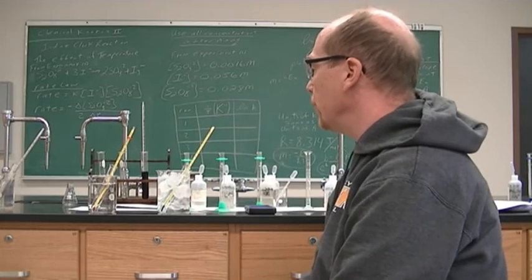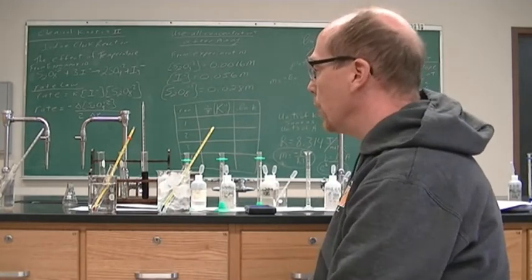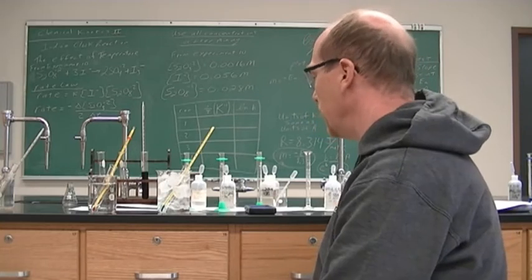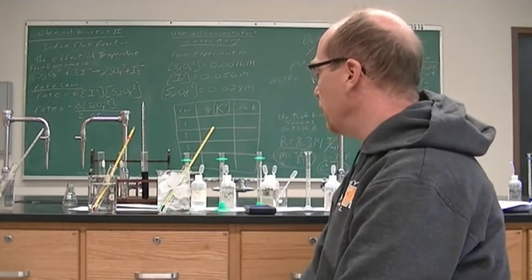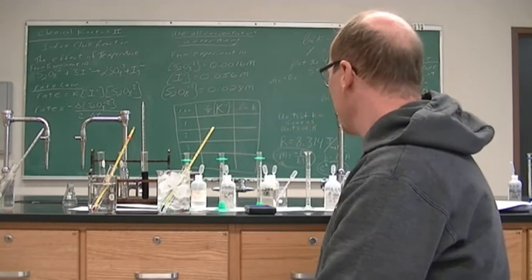We're going to write down the first number, and then we're going to wait and do our hot water last. It will be the fastest. So that one's not going to be near as long as the ice bath will be the longest, and then the cold water bath will be the second longest, and then the fastest is going to be the 10 degrees above room temperature.